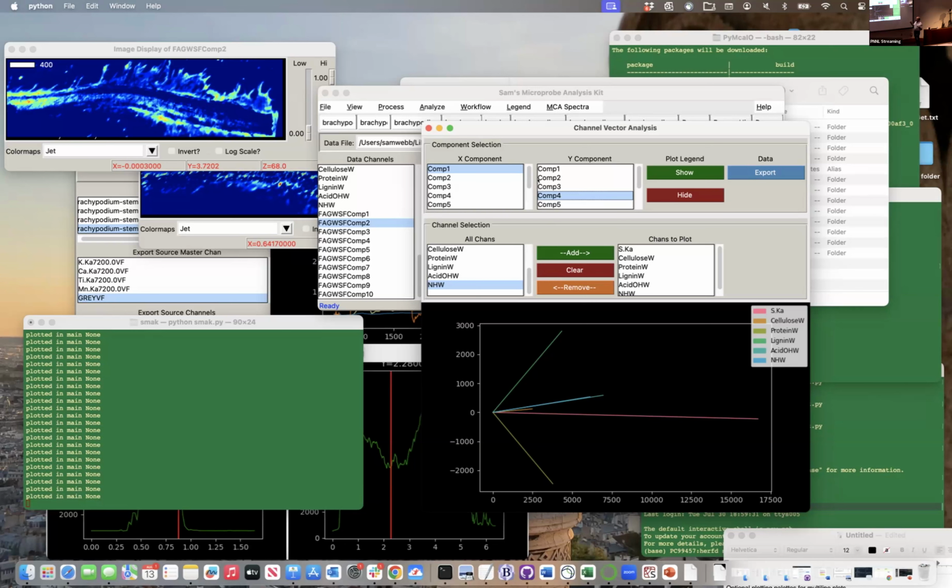And so we're losing a lot of that really cool halo that's really awesome in the hyphae. We're losing that in the XRF data. I would have really loved to see how that correlated better. So I think those kinds of things are part of the reason why this is happening. But again, it does show the incredible difficulty of multimodal data sets, and when you can get them to work, what you can see and what you can't interpret them to.